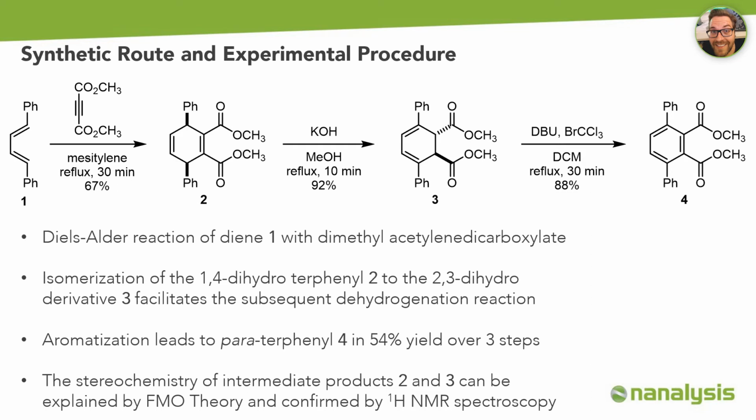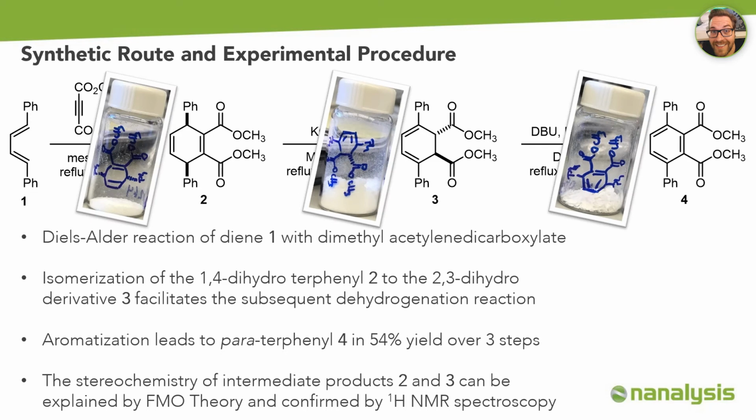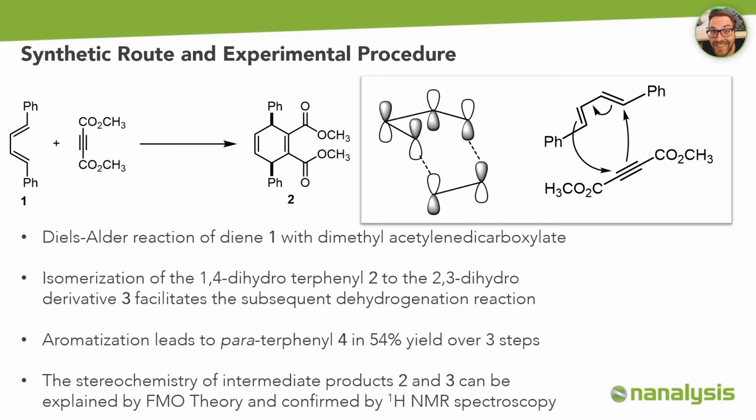over 3 steps. Each of the products was obtained as a white solid and can successfully be characterized by proton benchtop NMR spectroscopy. Interestingly, the stereoselectivity of the Diels-Alder reaction can be rationalized by frontier molecular orbital theory and confirmed with the acquired spectra by the students.